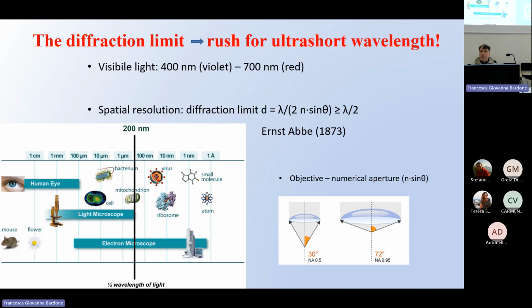But in the slide before, I told you that particles can behave like waves. So we can create a microscope with waves using particles instead of photons.